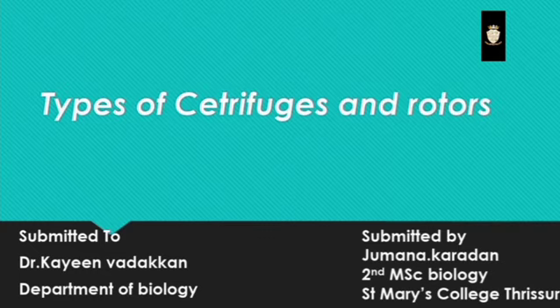Types of centrifuges and rotors. Myself, Jumana Karadan, 2nd MSc Biology from St. Mary's College, Thrissur, in the guide of Dr. Kain Vadakan, Department of Biology.